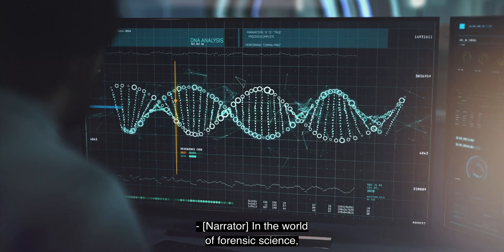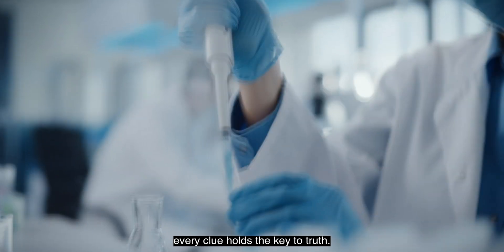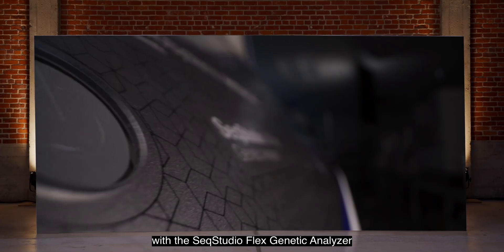In the world of forensic science, every clue holds the key to truth. Say goodbye to interruptions and hello to efficiency with the SeqStudio Flex Genetic Analyzer for Human Identification.